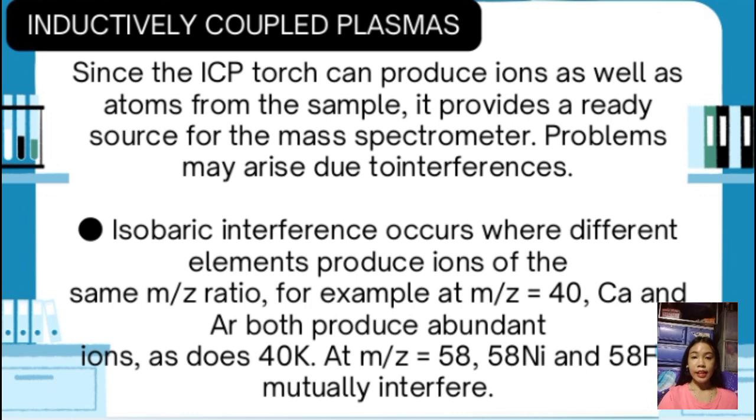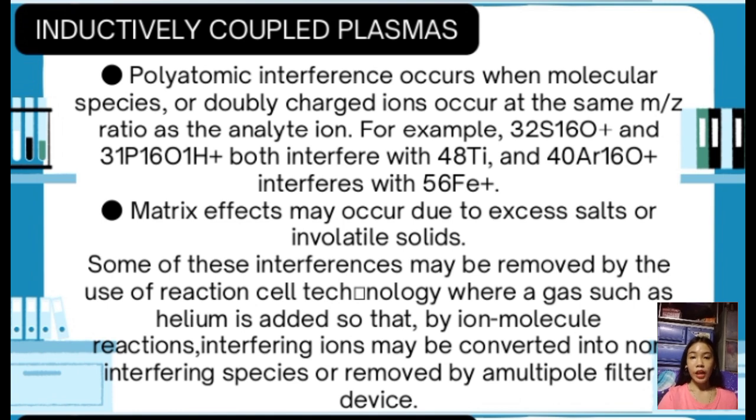Next, tracer studies. ICP-MS can be employed in tracer studies where isotopes are used to track the movement and transformation of contaminants in the environment. This application is critical for understanding pollution pathways and informing remediation strategies.